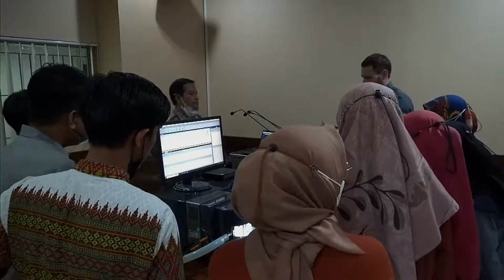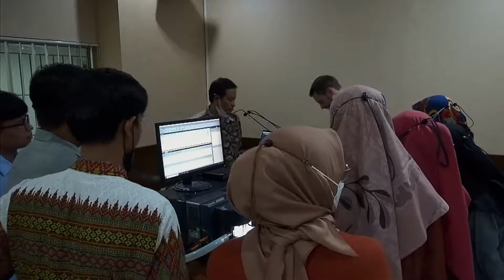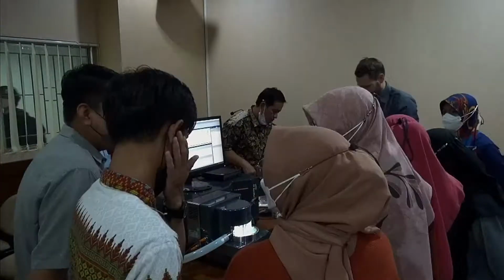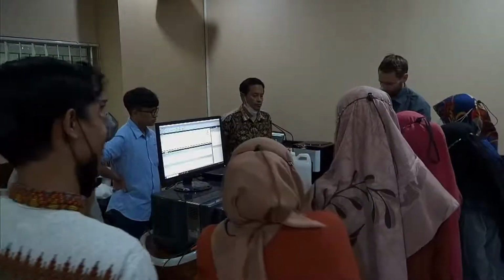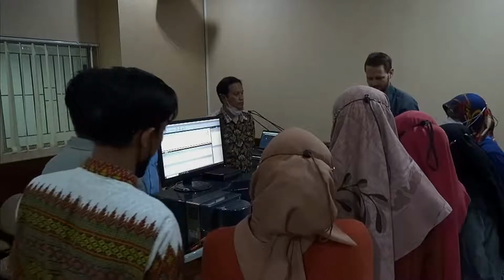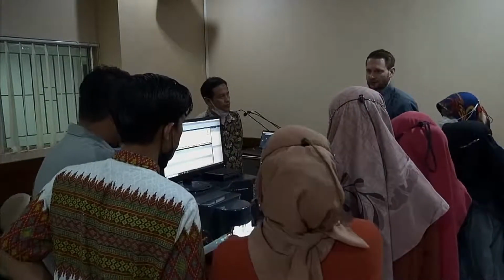We have some carbon black here. Let me maybe take, which one was the already opened one? So I could now just give this, as I did with the 500, directly in the dispersion unit. I will not, because I have experience with carbon black and I know what's going to happen.